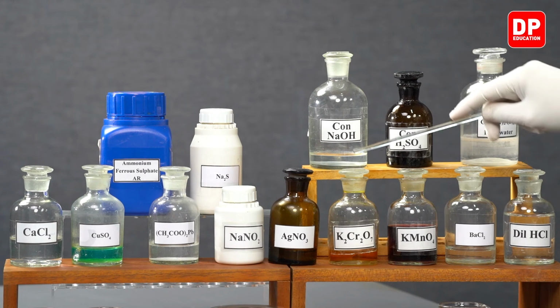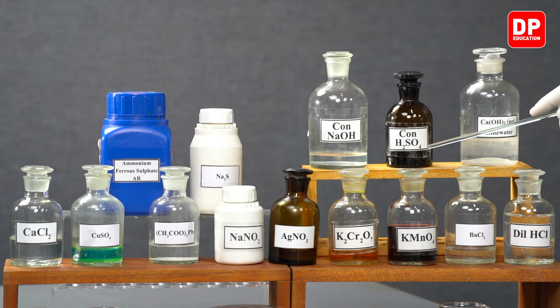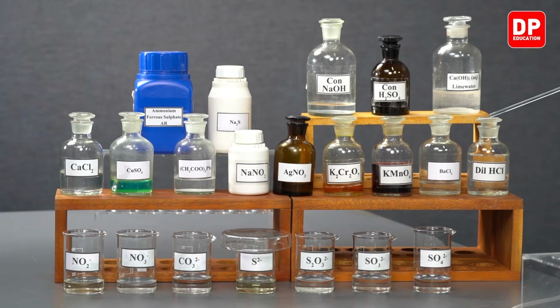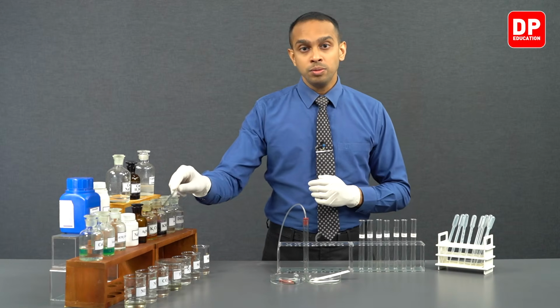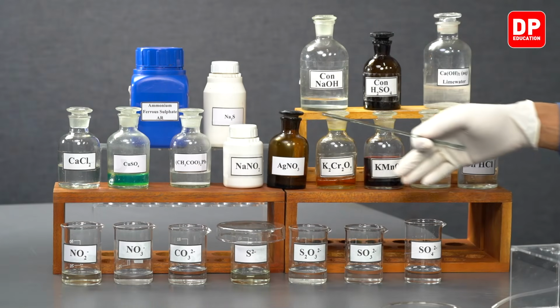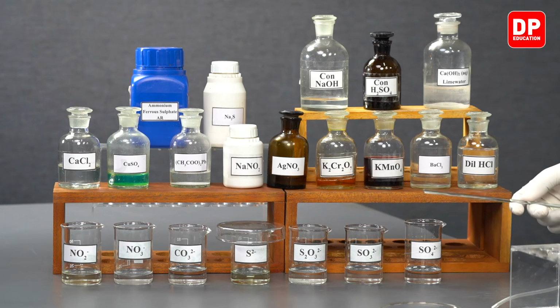potassium dichromate. You can observe the yellow color of potassium dichromate here. We'll be using potassium permanganate. You can see that it is purple in color. We'll be using barium chloride. We'll be using HCl. Now, apart from these reagents, we'll be using these anion solutions that we have here. We'll take a look at the anions that we'll be using in order.